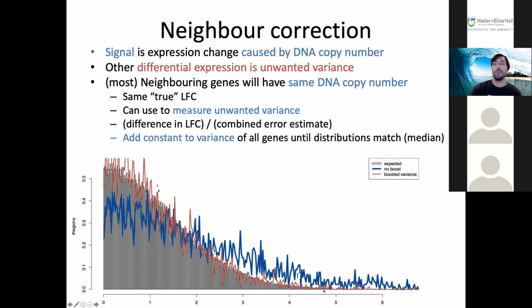So this is a 1 parameter fit. And you see how well the curve fits here. And this isn't a particularly good example. Almost all samples look like this. I don't know why this always fits. This goes both for RNA and for exome, but for some reason, this very simple fix is making these distributions match very well. So this isn't something where we're using the property of the copy number calling, right? We're using this neighbor property to check the variance estimates and make sure they're good. And if they're too low, we make them higher.